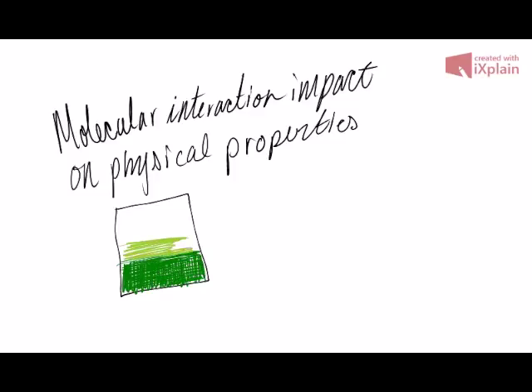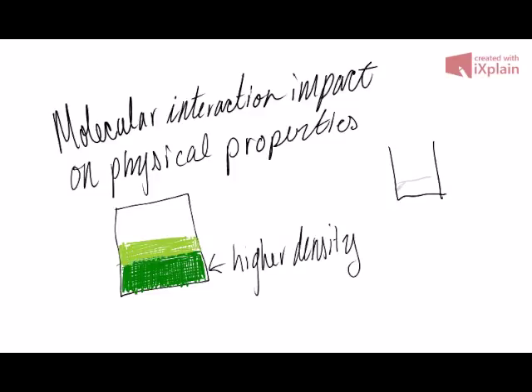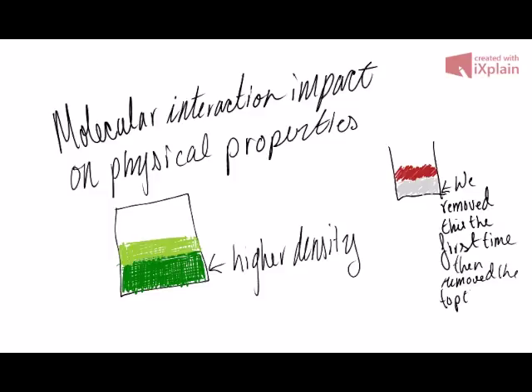The idea that like would only interact with like resulted in the separation of nonpolar non-ionic substances that was the benzyl acetate. Intermolecular forces also came into play in reference to the magnesium sulfate as it absorbed the polar water but not the nonpolar benzyl acetate. This allowed the mixtures to be separated out from each other.